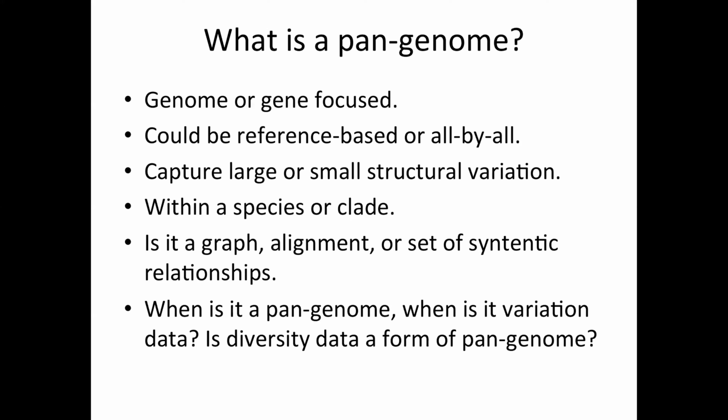So it's kind of a graph, I would say, and you would not have one single serial molecule. You will have multiple paths overlapping. So it can come up with something like what you have in hops, some kind of heterogeneity within the genome. So you start having a portion of the chromosome showing heterogeneity. So that's where I think the pangenome is going in direction.